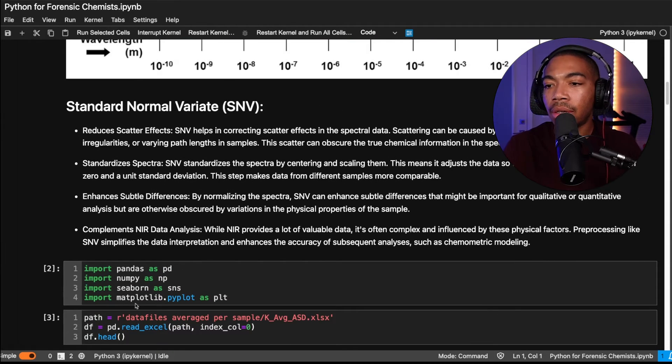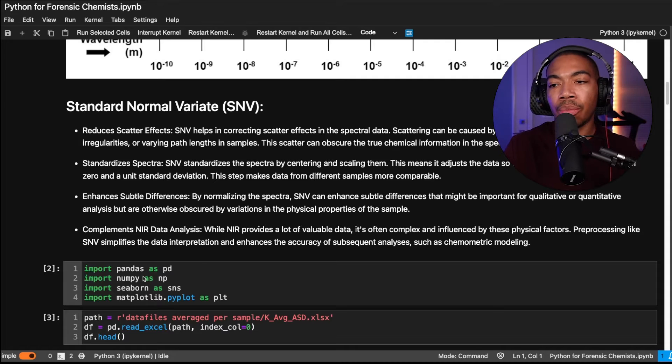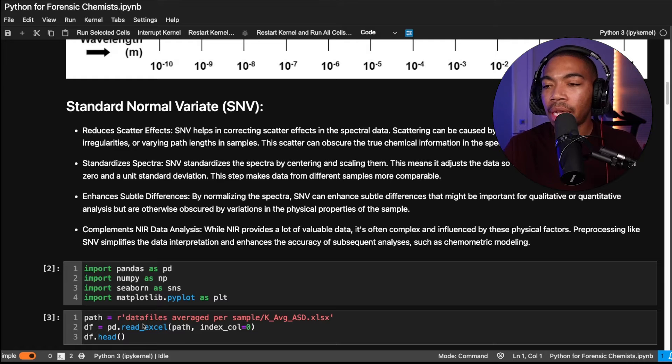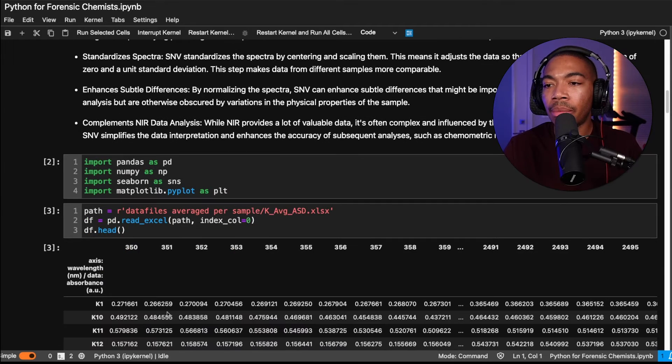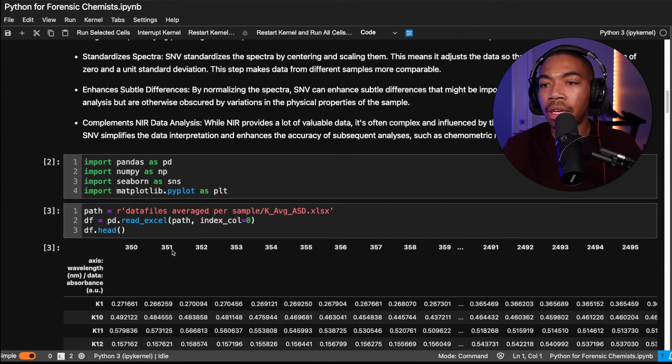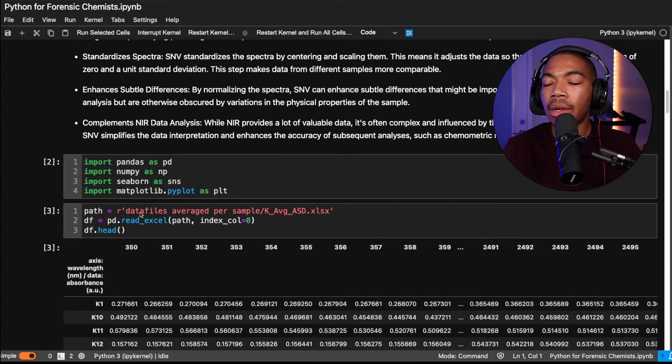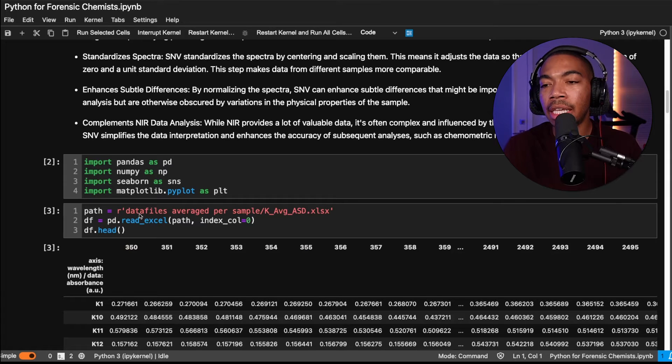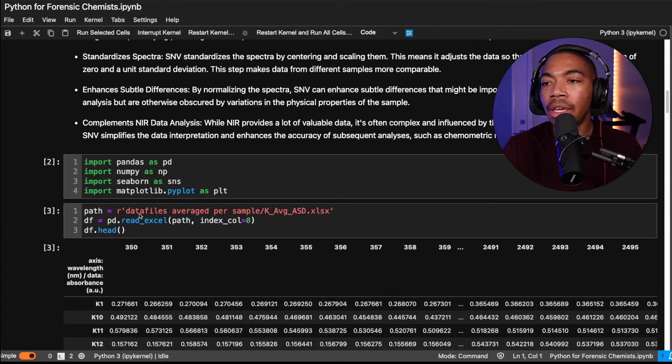And so to visualize and import the data, we're going to use pandas, numpy, seaborn, and matplotlib. I'll explain the data a bit more in a future video, but here I just want to quickly import it so we can see the effect of this SNV.